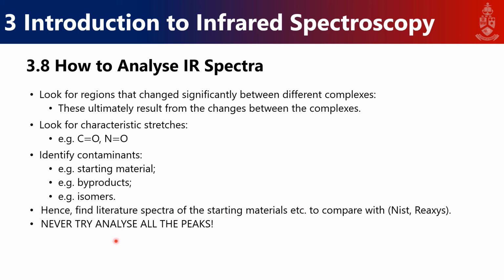But I must warn you, I know the first time you try to analyze IR, you try to analyze every peak. But you've noticed by now, I look at, ooh, these 3 peaks, and I talk about them, and then I say, yeah, there's a region there, and then I move on. That's exactly how you need to look at IR, because you're going to make yourself crazy if you try to analyze each peak. Because sometimes you're really not sure. You really just don't know. So the point is you're looking for your characteristic peaks, your fundamental peaks.